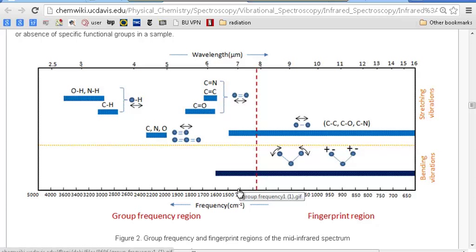Below 1500, or according to this 1250, you have regions which are particular for a particular molecule. This is called the fingerprint region. Each molecule will have an almost unique characteristic down here in the fingerprint region, whereas molecules that have the same chemical group, for instance carbonyls, all molecules with carbonyls might have an absorption here. But down here, those carbonyls will be distinguished by the different molecules.